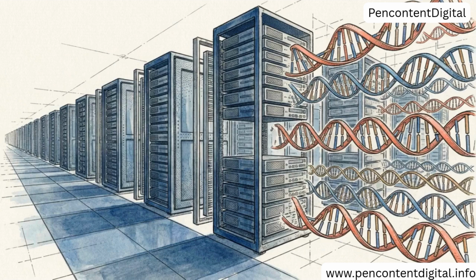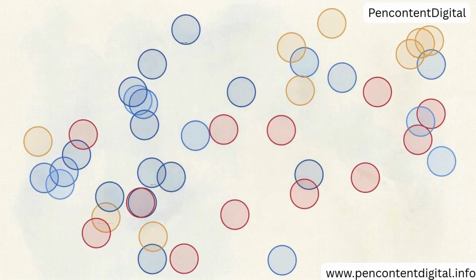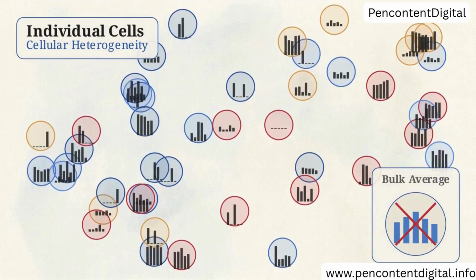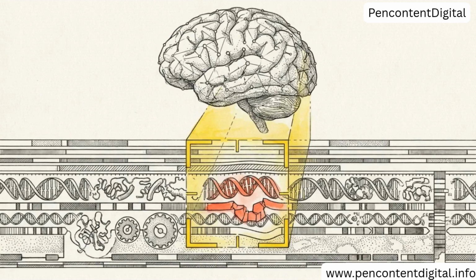As sequencing technology advances, platforms like IGV are evolving to manage increasingly large and complex datasets. Emerging trends, such as single-cell genomics, require tools that can visualize the diversity of individual cells, rather than the average of a bulk tissue sample. We are also seeing a shift toward cloud-based analysis and AI-assisted interpretation, where algorithms flag potential anomalies for human review within the viewer.